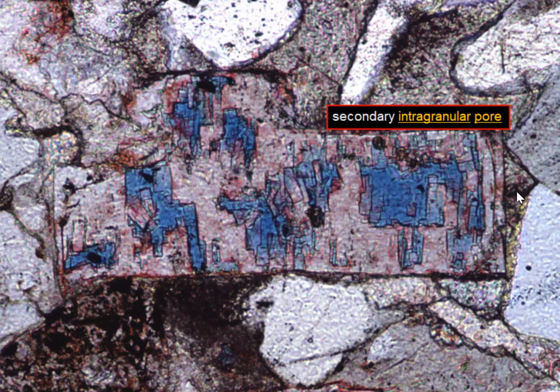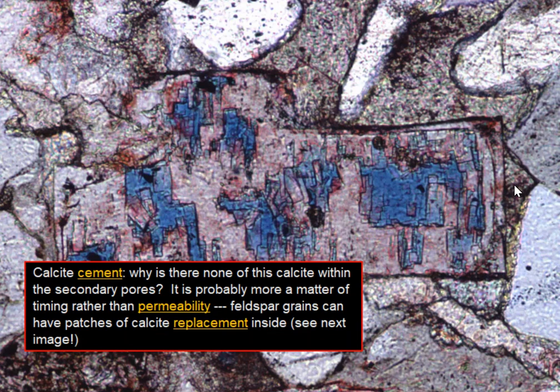Okay, well, we hadn't looked at what was the information available to us here in this odd little area. Okay, we've got a calcite cement here. Okay, so we have our arkose. Our arkose has some grains that look like perhaps quartz or feldspar, looking very much like quartz here.